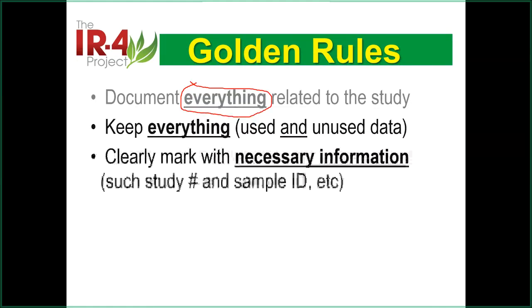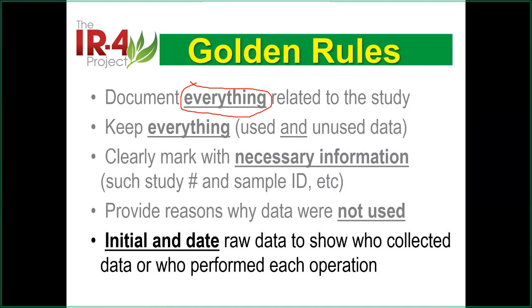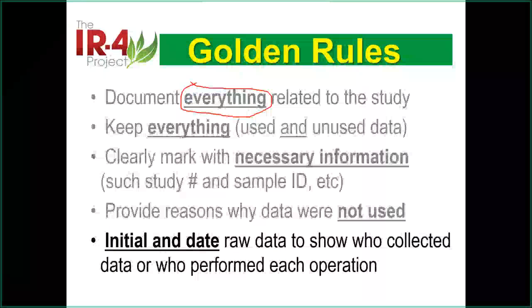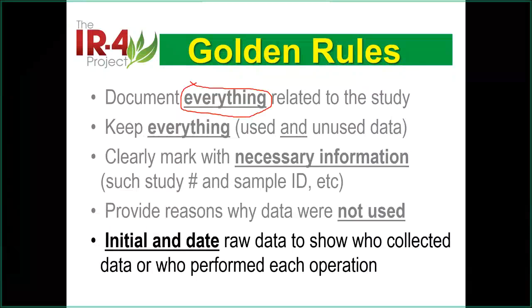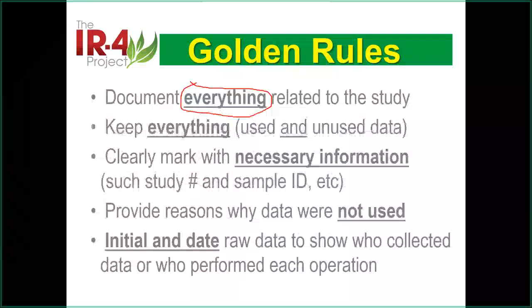And you need to write down all the necessary information. You need to write down the reason. And you need to initial and date all raw data. So that's the requirement. Okay, what time is it? It's 7:06. Let's do a little bit more before we take the break.